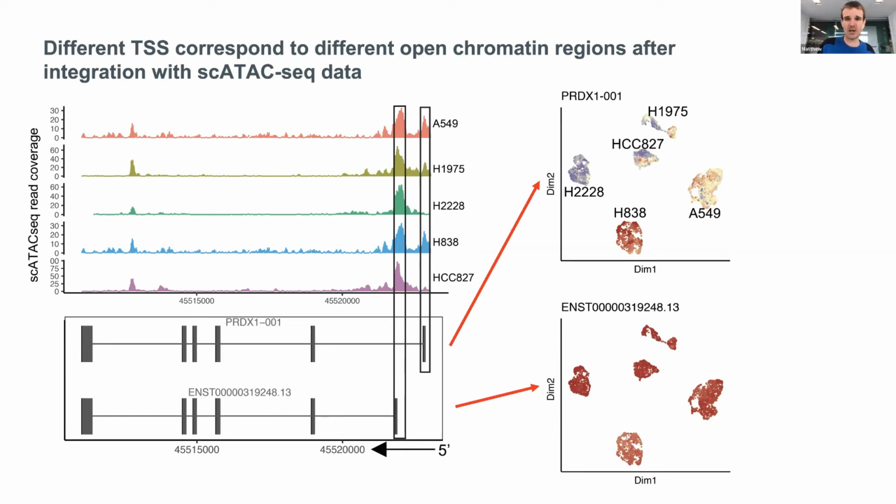So I guess that's another example of integrating data from different 10x genomics kits to potentially get a bit of extra support for the isoforms you see, so you can be confident that it's not noise in the data, it's actually a genuine difference in start site for this transcript.